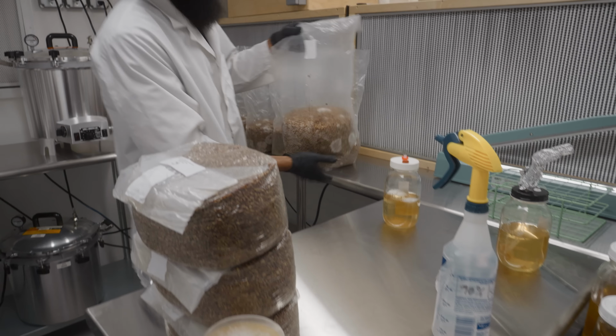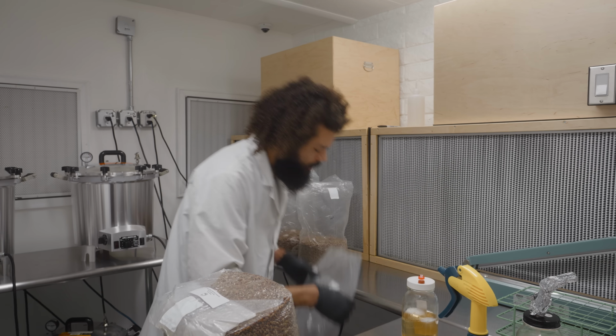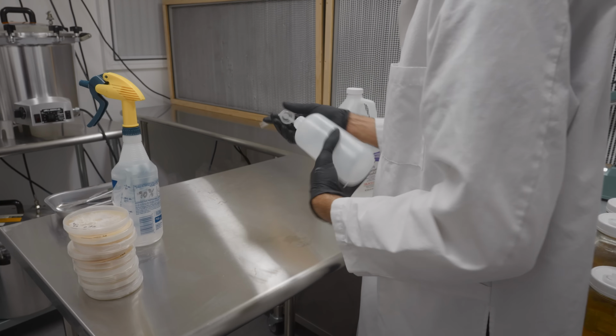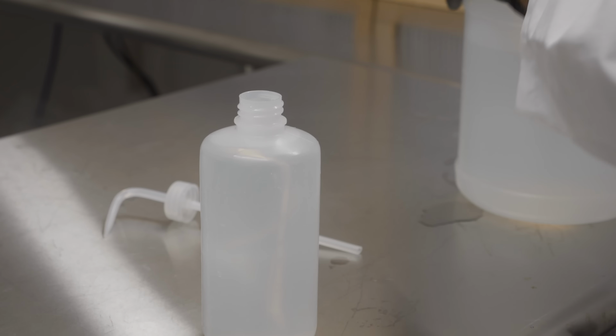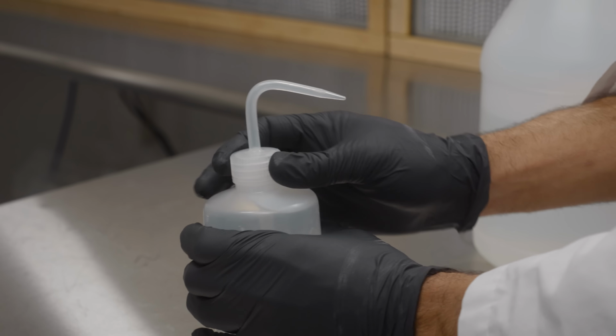So yeah, I'll put these away right now, kind of get set up. We have some fresh sterilized grain in the sterilizers. So I'll just get myself set up real quick. Making sure I have some alcohol in these containers. These come in handy just for washing your hands throughout the process. Usually between transfers or between handling bags, I just like to get a nice douse of isopropyl and utilize it.